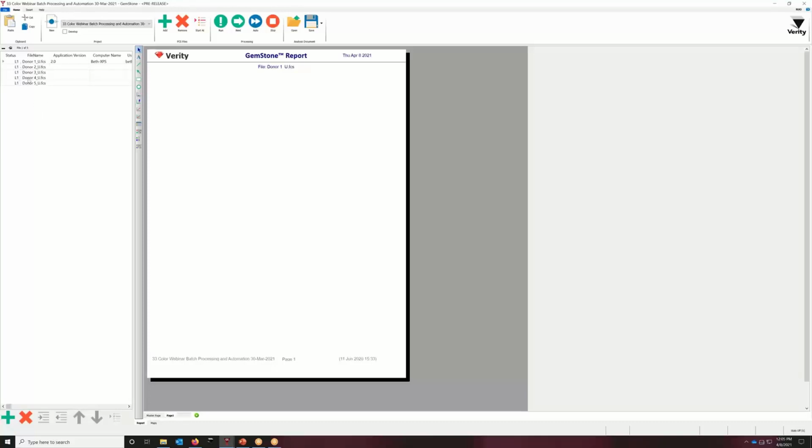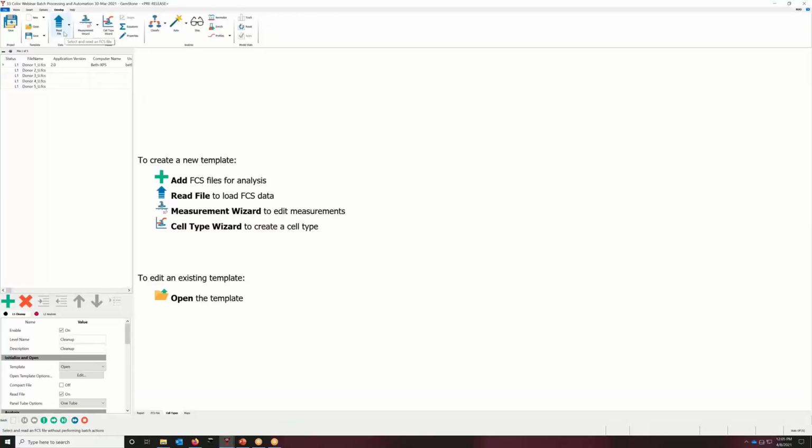And by default, the program adds the data files to level 1, which you can see here on the left. We're going to talk more about these levels shortly. And then to set up the batch, you must be in develop mode, which is here. There's a little click box. So we're going to check that click box to activate the controls. When I check this box, the view changes to bring up a new tab, which is the develop tab here at the top.